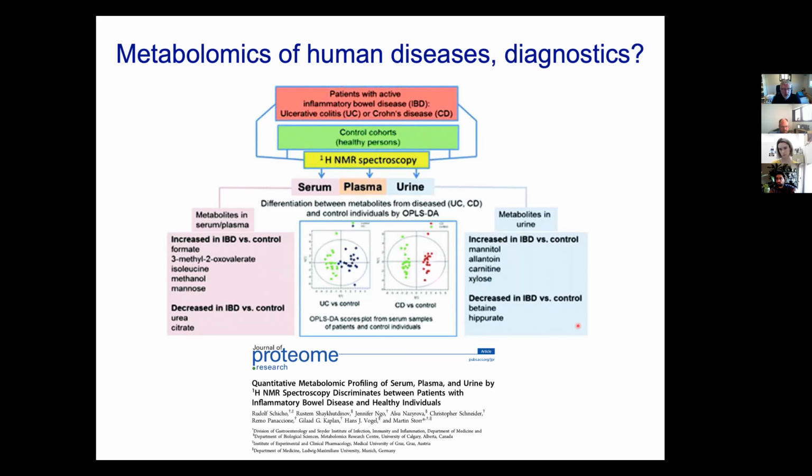And so these are potentially very powerful methods to start diagnosing disease, because you only need a blood sample or a urine sample to actually analyze who may have this disease. And you don't have to do invasive biopsies or other complicated experiments to actually do this. And so this is an application of NMR, proton NMR in particular, that still continues in many laboratories around the world, including mine still, where people look at various diseases.